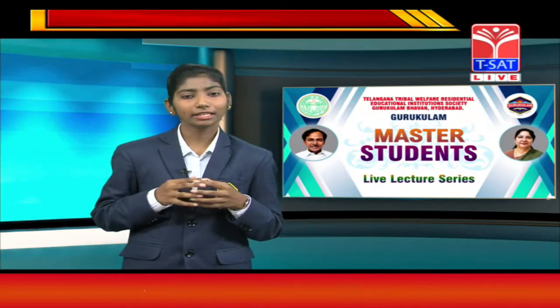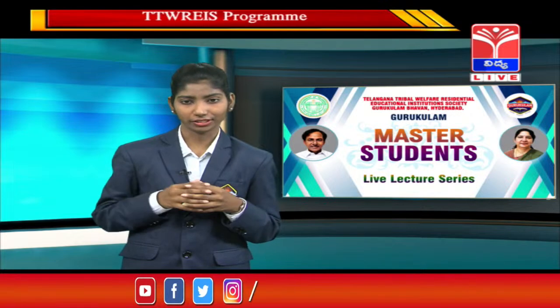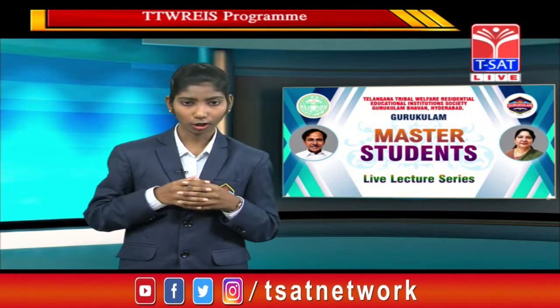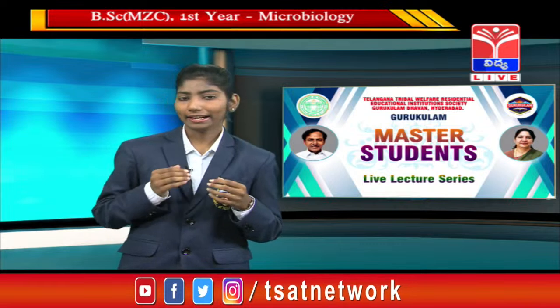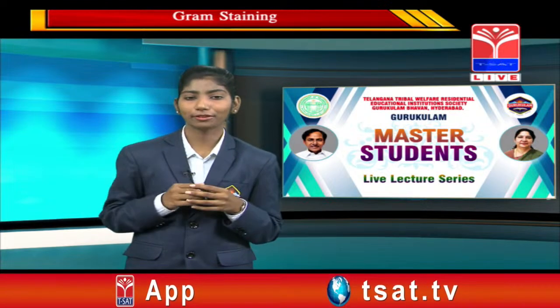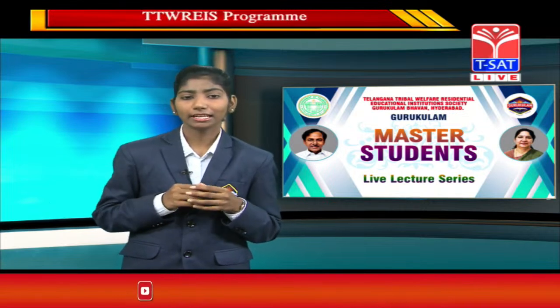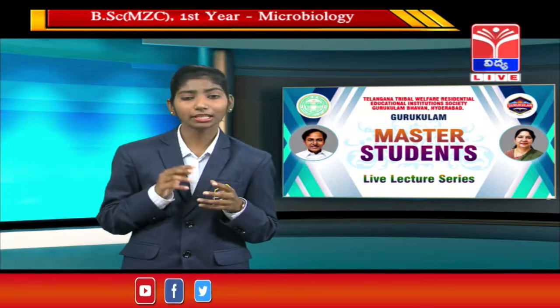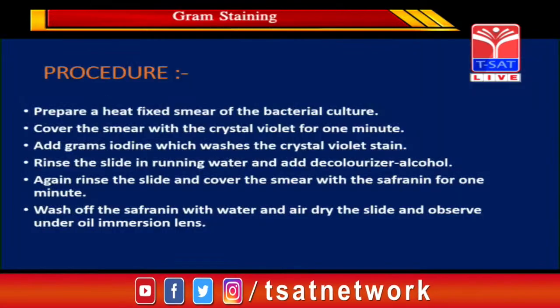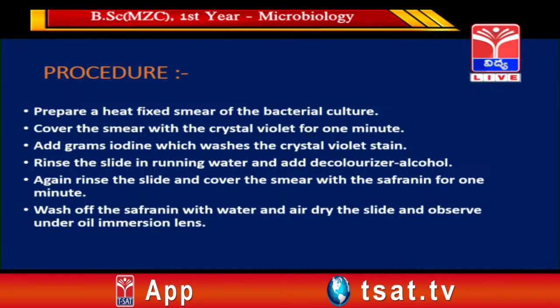So, after rinsing the slide in running water, add the decolorizing agent. And again rinse the slide and cover the smear with safranin, and after that wait for a minute. After that, wash off the safranin with water and air dry the slide. Then observe this slide under the oil immersion lens. This is the procedure of Gram staining.